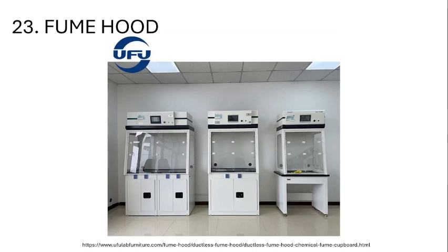Next is the fume hood. This is a lab equipment. In our actual laboratory, most of the fume hoods are modified, fabricated. The main purpose of the fume hood is to protect the user, the one conducting the experiment, from hazardous fumes, especially from concentrated acids and other chemicals.